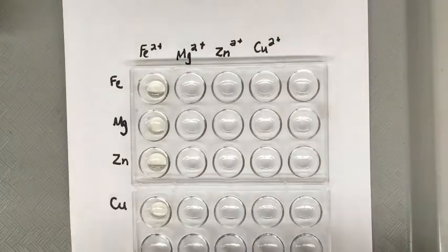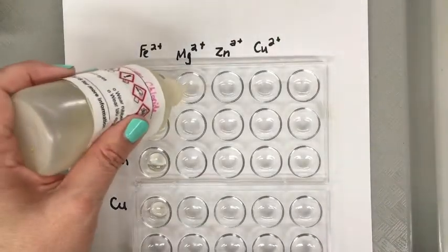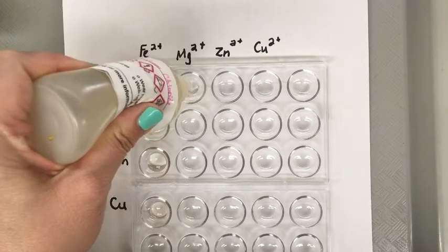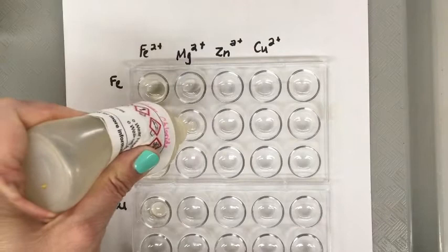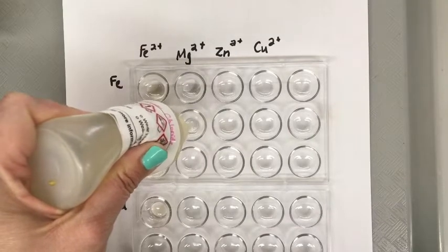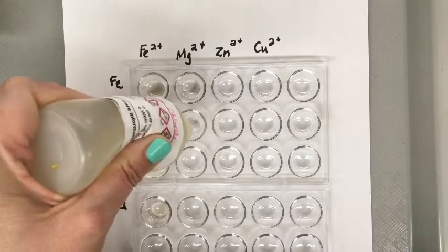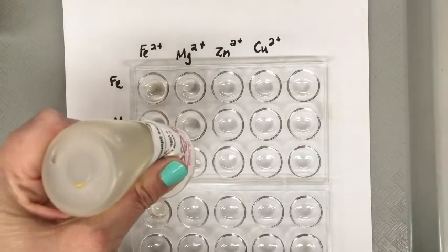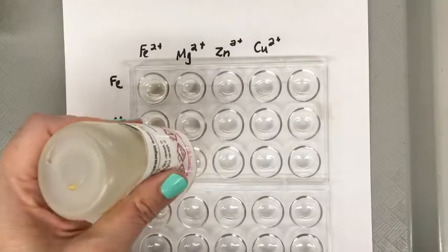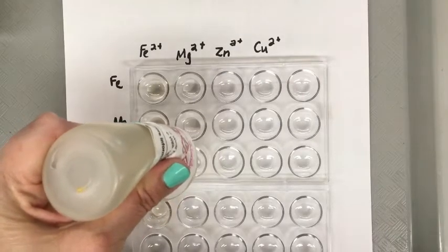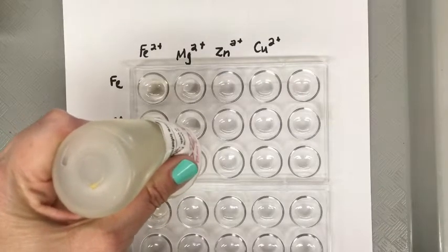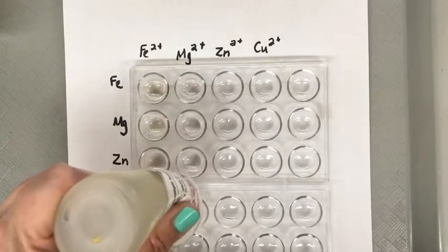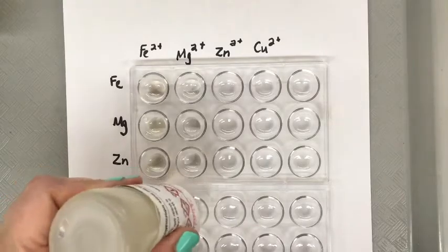Next column, this one's a little slower at the dropping. So some magnesium ions in each of these ones. This one's really hard to release the drops.